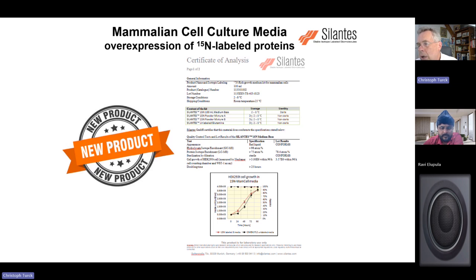But I would think, if you have turnover data, I would argue that a lot of this turnover is probably the same, doesn't change that much over time, unless there's certain drug treatment or other environmental insults that are happening. So you can maybe deduce the protein turnover from that snapshot also for the other developmental stages.